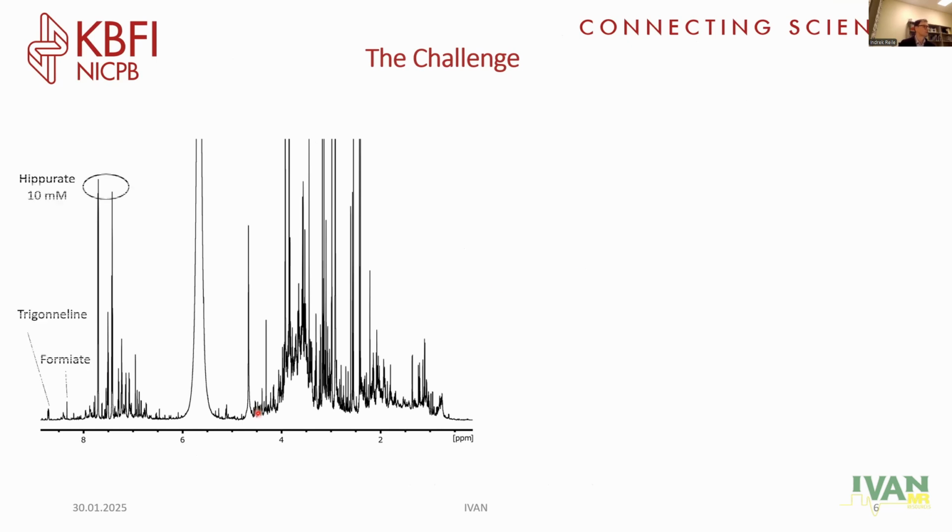What you have here is also that it's evident that we are detecting a massive number of signals. It's a very crowded spectrum, with a very wide dynamic range of metabolite signals in it. Certain things we can resolve here, but the really interesting stuff is probably going on at and below the carbon satellite intensity level of the most intense signals. Even if you could detect the signals you are interested in down there, they are probably going to be flanked and overshadowed by the big signals here.